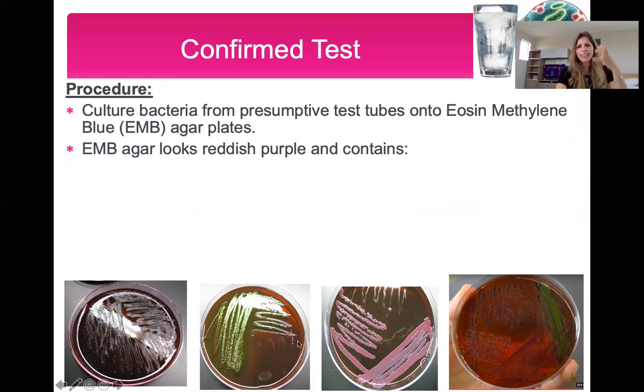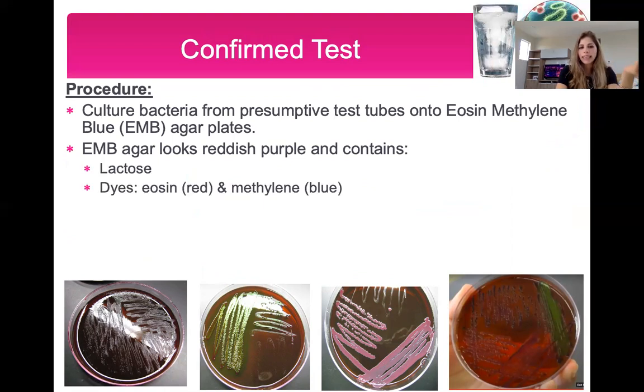So to me, it just looks like a red agar plate, reddish purple. And this agar has lactose and it has dyes. It has red and blue dye. So red and blue make purple. So the plate looks reddish to me, but a lot of people say it's purplish.